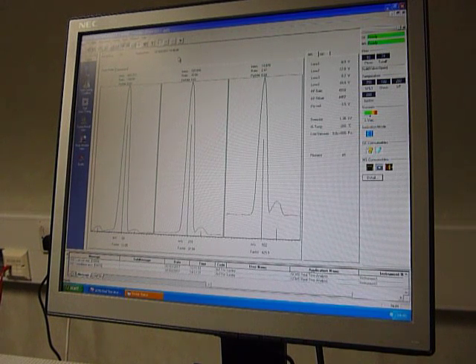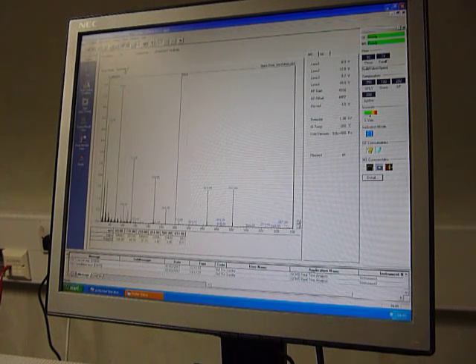There's the latest tuning now — quarter to three in the afternoon. This is looking quite good in the spectrum. There's your mass 69. All these masses here are due to the fragmentation of PFTBA — for example, mass 100, CF2, CF2. You're also looking for water at mass 18 (H2O), and by tomorrow morning that will be down. You're also looking for air — mass 28 for nitrogen, 32 for oxygen, and 44 for carbon dioxide. That's a good tune, and it will be good enough for us to run the decane sample, which is the next part.